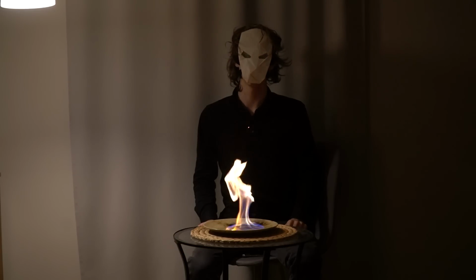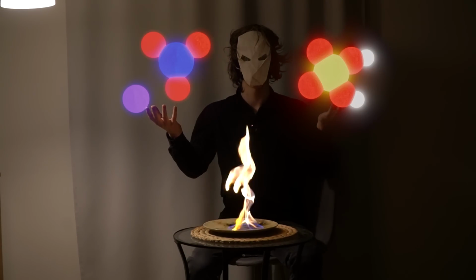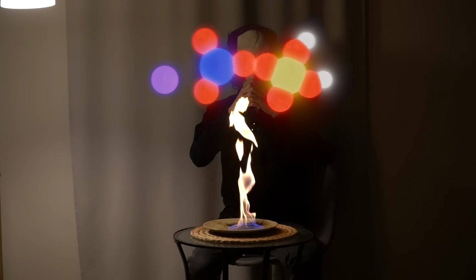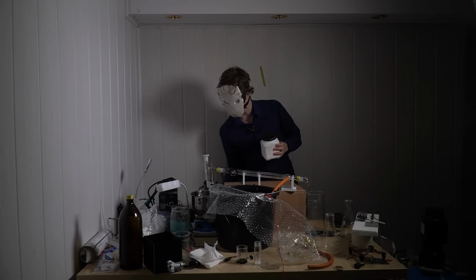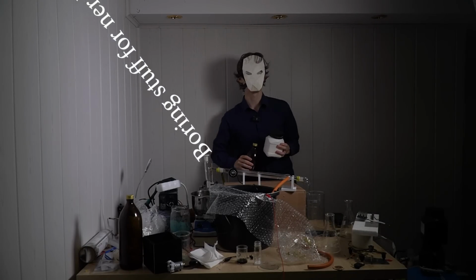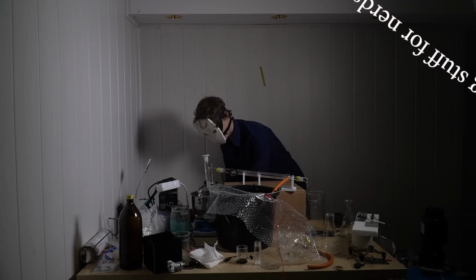And in order to do that, we'll first take some sulfuric acid, then some sodium nitrate, and then react them together and distill. Should be simple, right? Pour in some sodium nitrate, here pour in some sulfuric acid, right there, then heat to over 140 degrees Celsius, then let it go on and condense with nitric acid. For each 98 grams of sulfuric acid, we need 85 grams of sodium nitrate, except with sulfuric acid, it's not 100%, not close. That should be close enough to going.